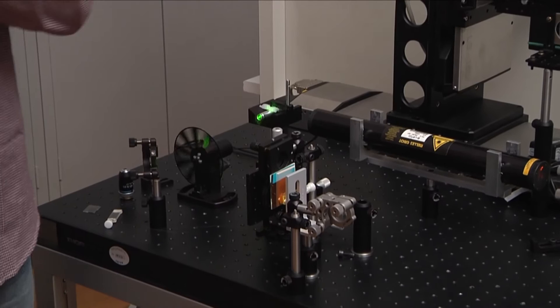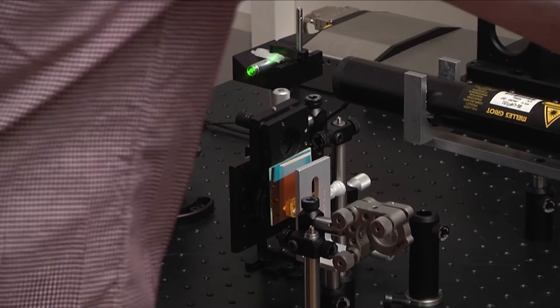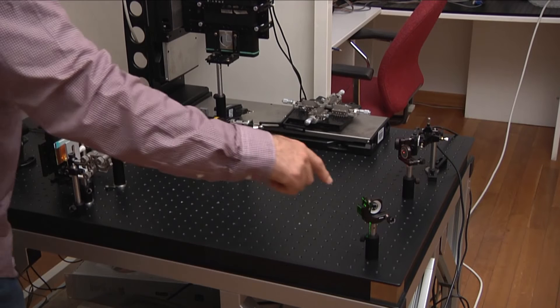Then we produce an optical element called thermal lens, temporary thermal lens there, which is tested by a second beam called probe laser. This laser path through the sample one times, twice, is reflected here, and then detected there at the detector plane.